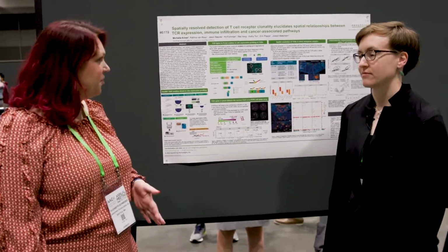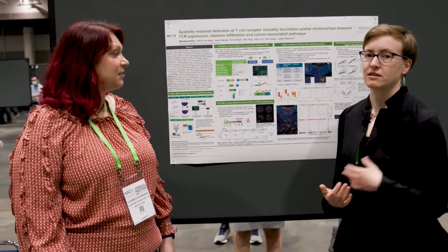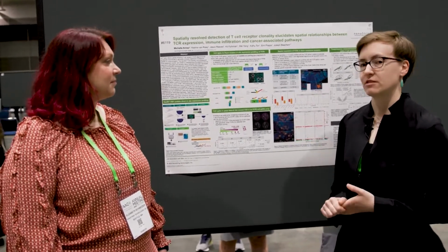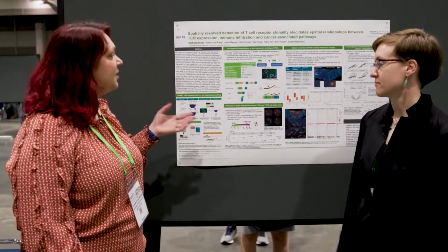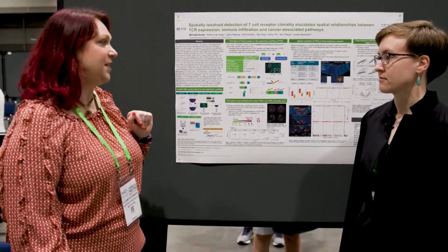And we have that for human as well as mouse? Yes, we have a human Whole Transcriptome Atlas and a mouse Whole Transcriptome Atlas. The TCR spike-in panel is specifically designed for the human, not for the mouse TCR. Okay, so what type of samples, like what type of cancer samples or tumor biopsies were used in this study?